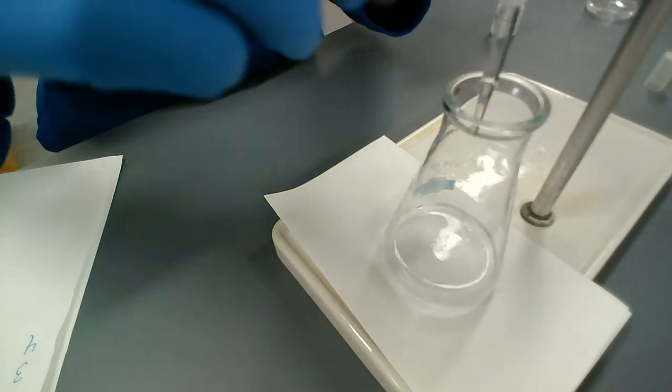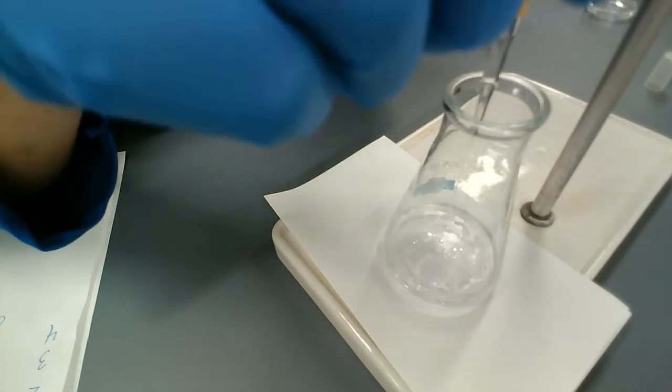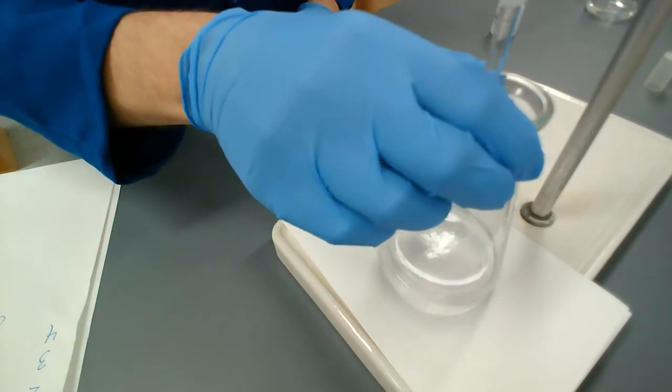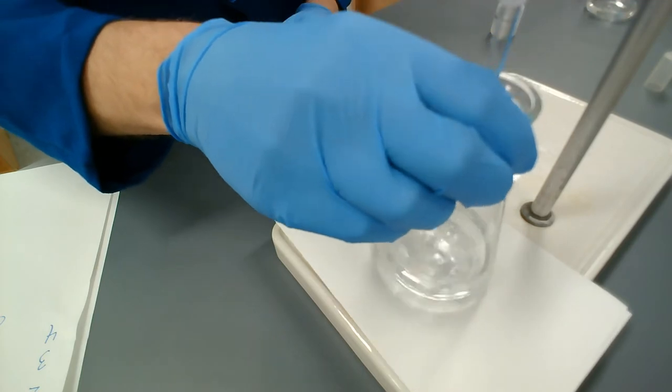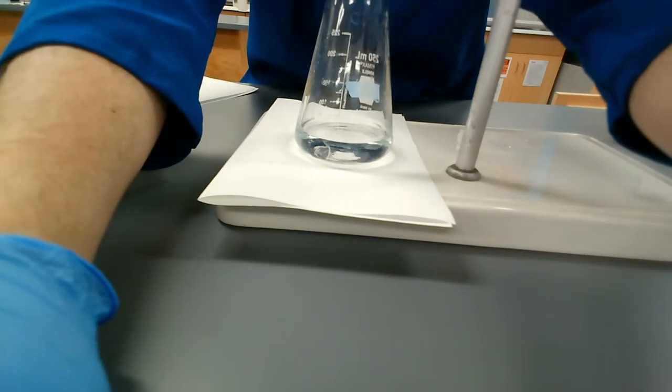Even though this stand is a cream white color, I want it to be a white white. So I'm grabbing a sheet of paper, folding it over, to try to get a good color. So you can see where it's dropping. There's a very faint pink starting to form. I'm closing the stopcock back up here and giving this thing a swirl. That pink color should disappear as the sodium hydroxide mixes into the oxalic acid solution.